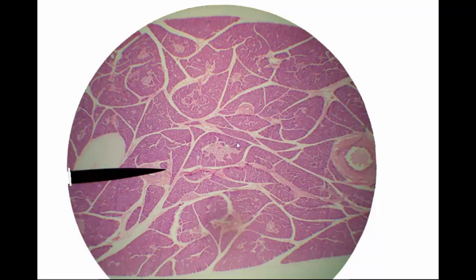Speaking of which the dark purplish tissue that we see around the pancreatic islets. And in many other places in these lobules here. That is acinar tissue. Or you could also say these are acinar cells. The acinar cells make up the beginning of the exocrine gland part of the pancreas. The acinar cells make pancreatic juice which contains lots of different digestive enzymes for breaking our food down at the molecular level, for doing chemical digestion.